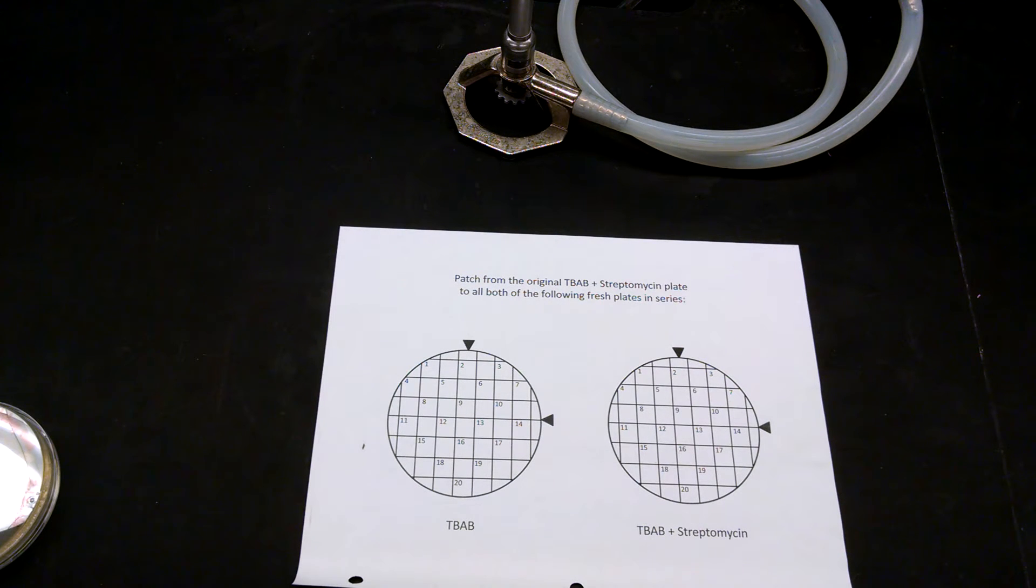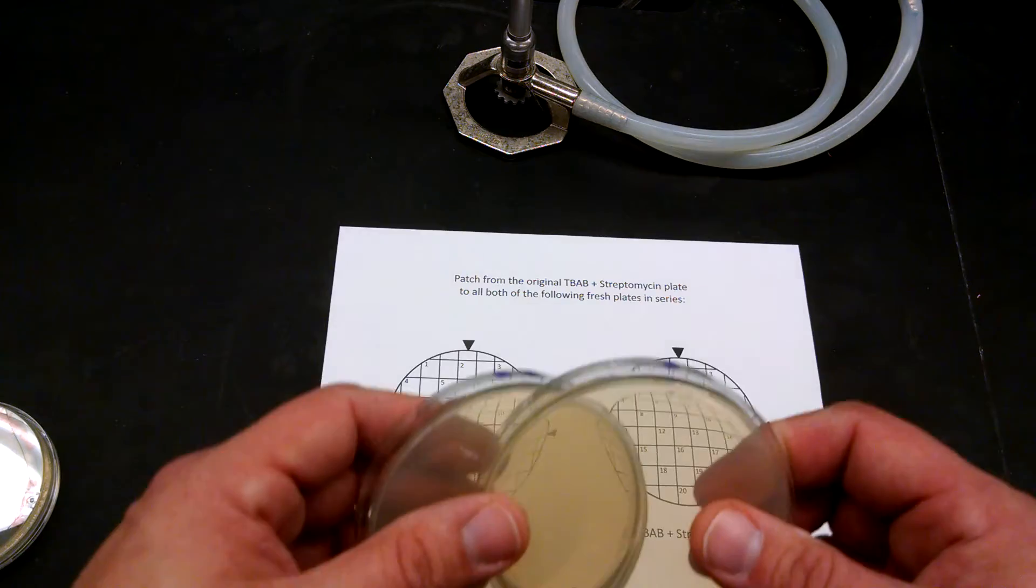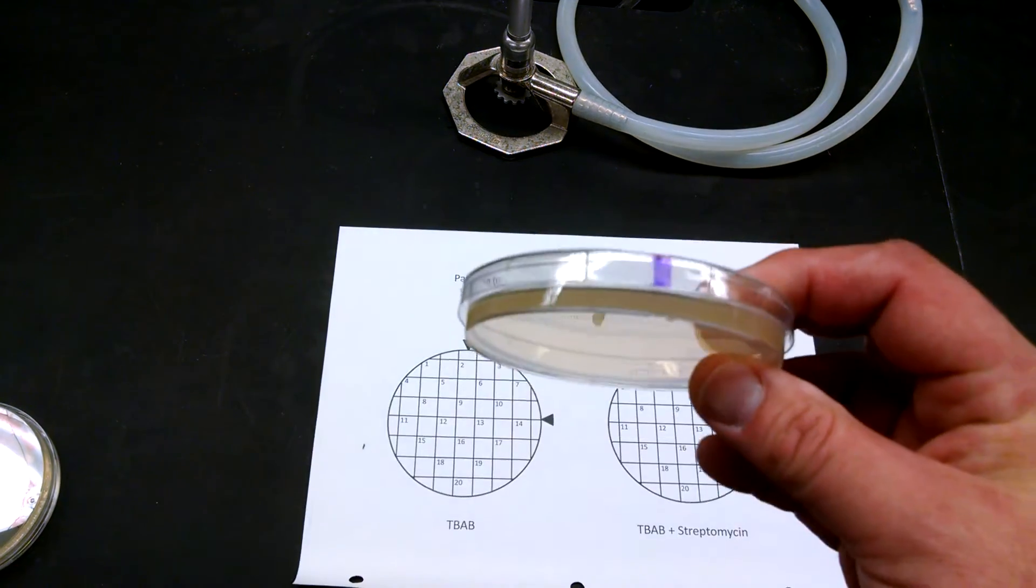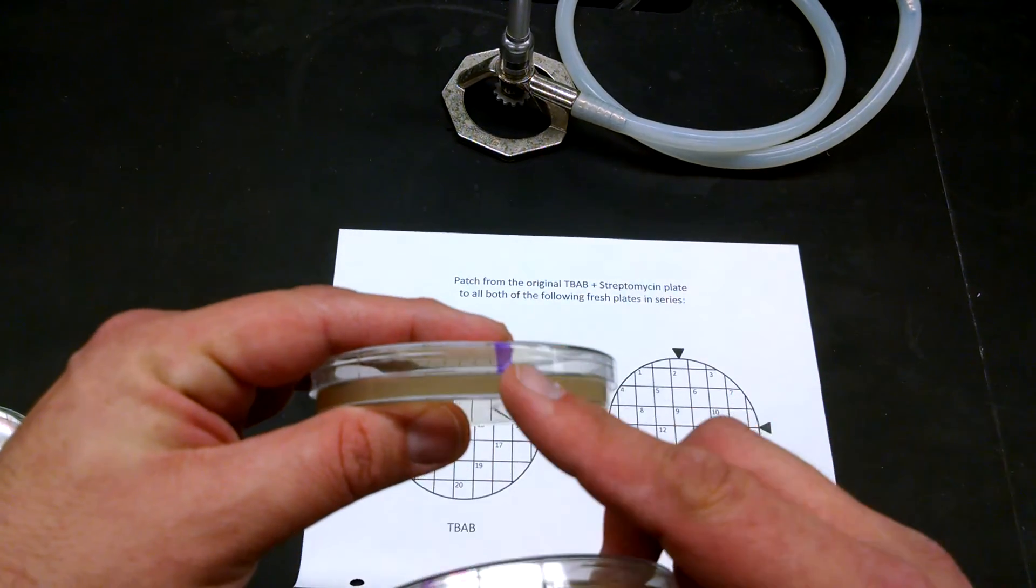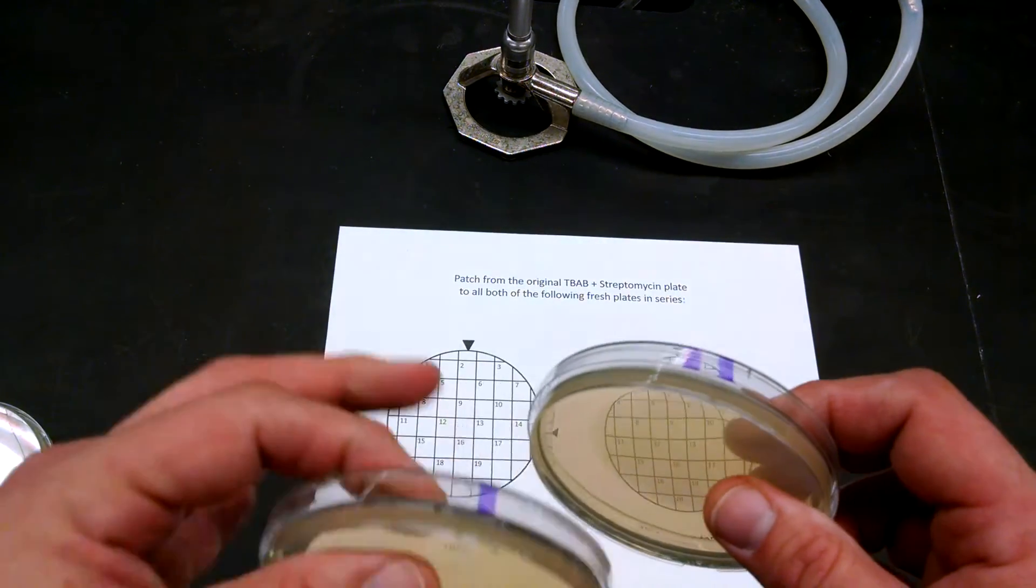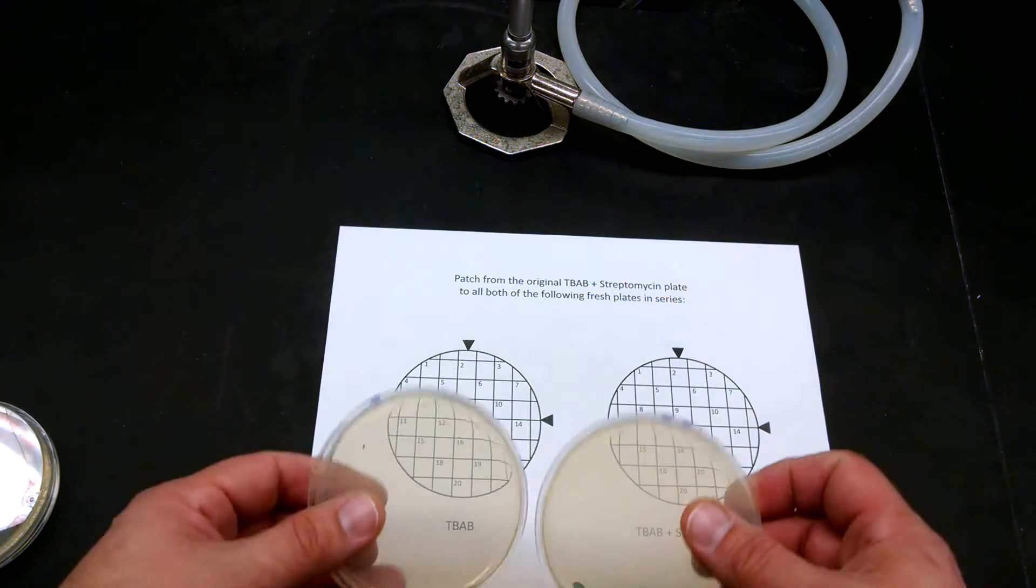You're going to need whatever plates that you want to test that have the different conditions. And so what we need is a TBAB plate and a TBAB plus streptomycin. One purple here is TBAB, two is streptomycin. But again, whatever it is that you want to test is fine.